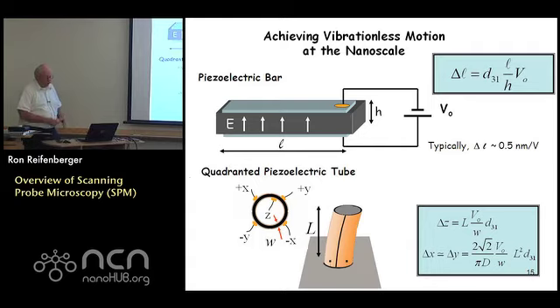Okay, we also have to achieve nanoscale motion, which is vibrationless. So when we move this tip, I was talking to you about moving the tip over the substrate in a systematic and controlled way. How are you going to do that? You just can't hook up a motor. You can't turn a gear or a micrometer, because anytime you do that, you're going to introduce all kinds of uncontrolled vibrations.